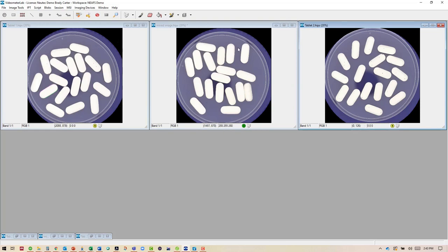What you'll notice is that if you look at all three of these images, there's just no way to figure out if there are tablets in there that are any different, just from a visual standpoint. We don't have the capability with the naked eye to differentiate between these two. But with this imaging system, now that I know I have pure versions of each of the different tablet types, I can teach the system to recognize each of these pure tablet types.